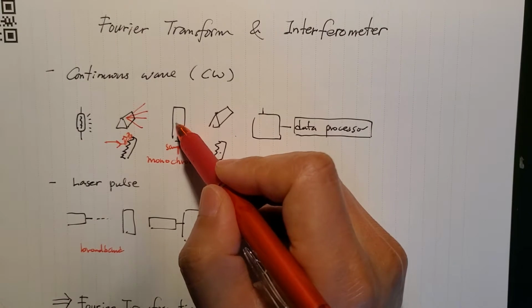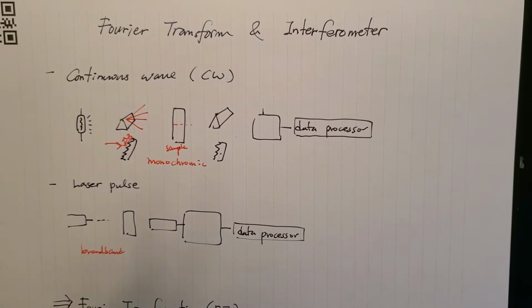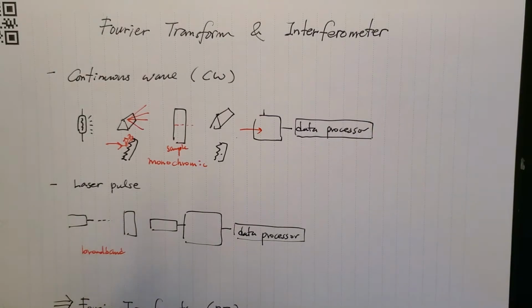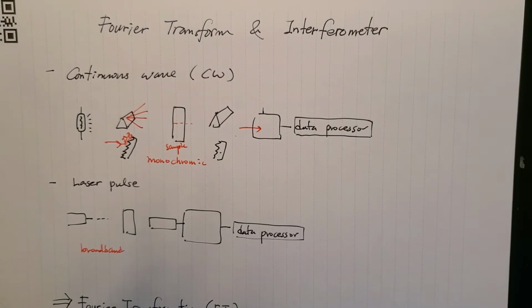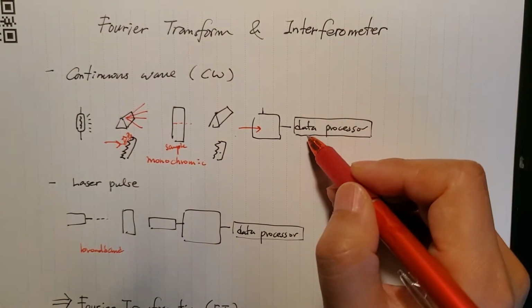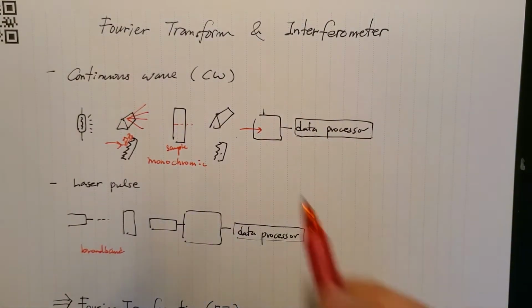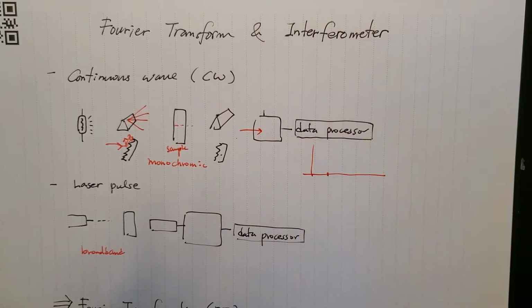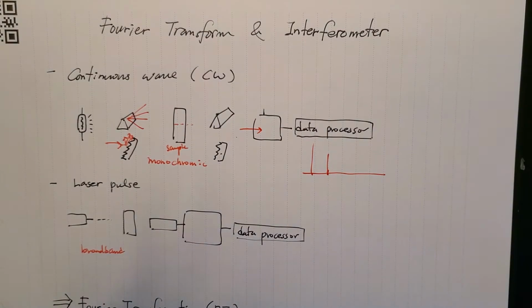And then even after going through the sample, you can have them purify the wavelength. And then the light comes into the detector, and in the detector, the photon is turned into electricity, and the intensity of the electricity, the amount of electrons that get detected by the detector, will be simply plotted out, as the machine knows what wavelength is coming in now, and that's giving this much electric power.